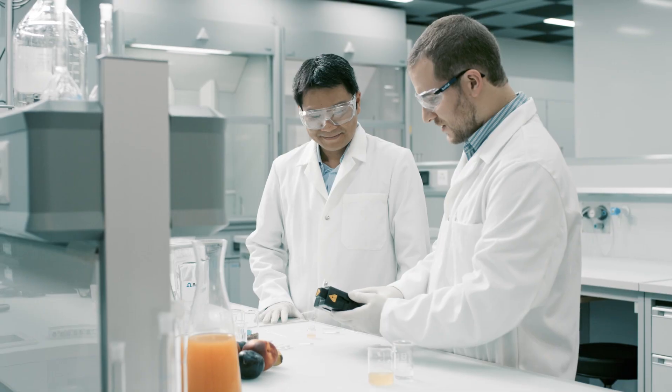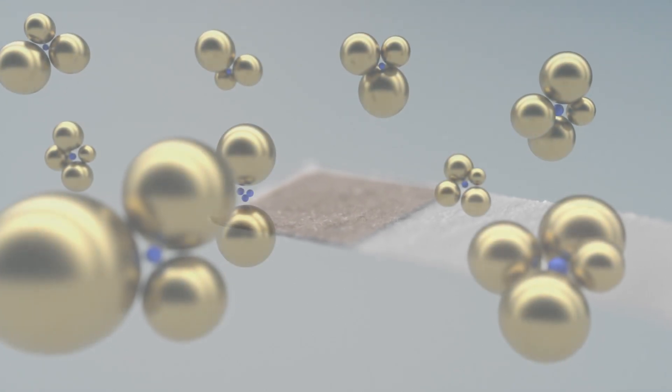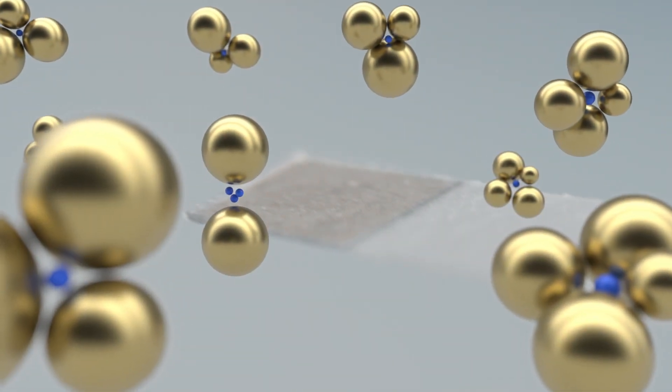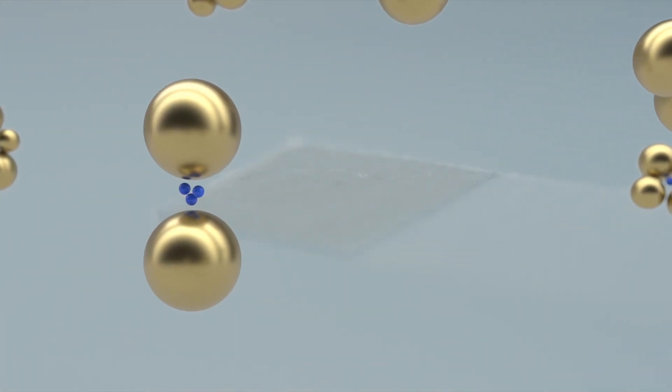That was quick. Very good. The unique capabilities of printed surface-enhanced Raman scattering P-SIRS for short, comes from nanoparticles printed onto a paper matrix.